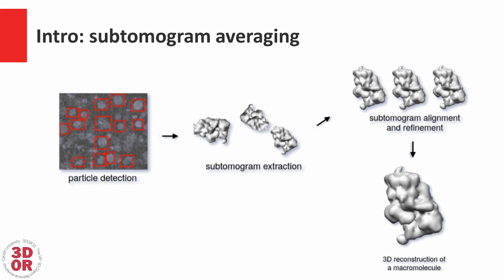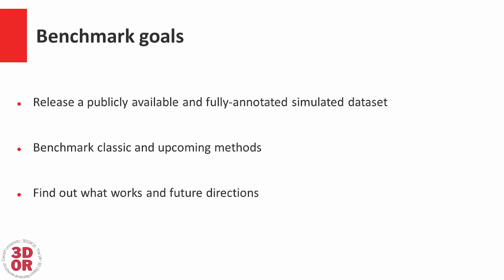Researchers come up with new methods to tackle this, but the comparison of such methods is problematic, and that brings us to the goal of this benchmark. With this work, we hope to support researchers developing new methods by introducing a novel, publicly available, and fully annotated simulated dataset. This should allow direct comparison of the methods and will hopefully provide insights for future research.